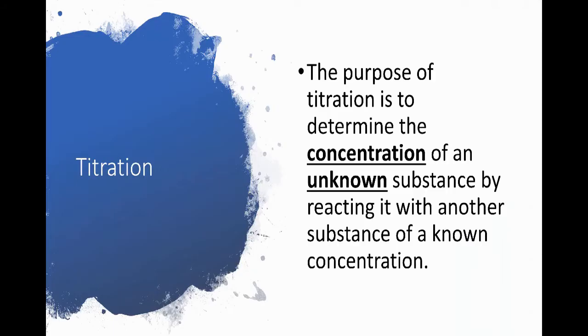And so this is your notes portion that's fill in the blank. Whatever is bolded and underlined is what will go in the blanks there. So the entire purpose of this thing called a titration is to determine the concentration of an unknown substance by reacting it with another substance of a known concentration.